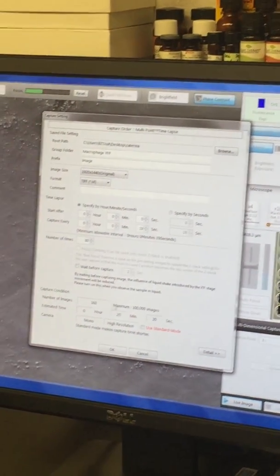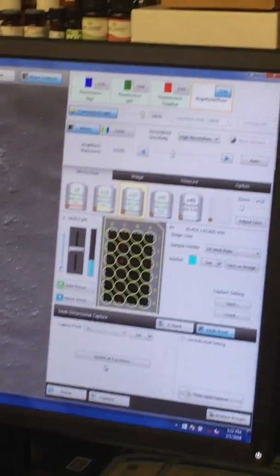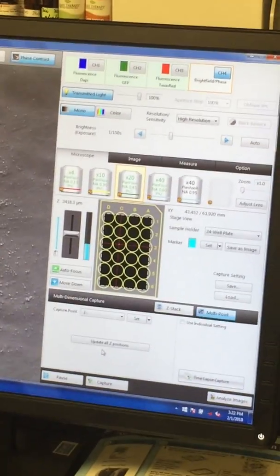Do you want me to cover anything again here and show you how it's done? No, I think that's really helpful. Okay, seriously though, if you have any questions about this, wound healing assay is very, very common on this microscope. Give me a call.